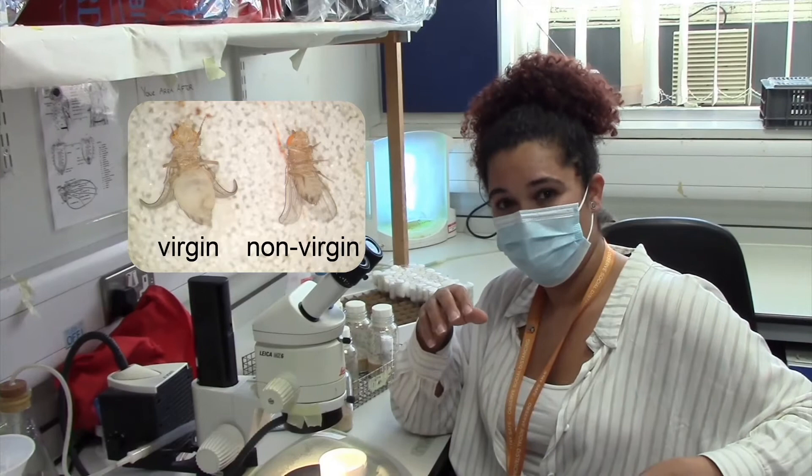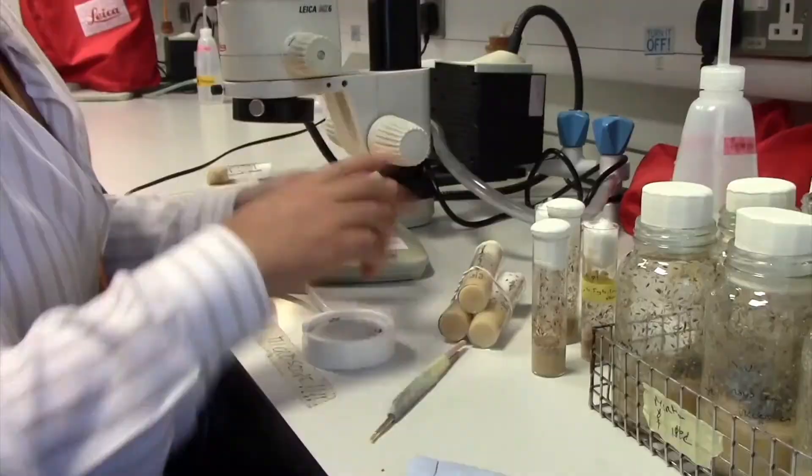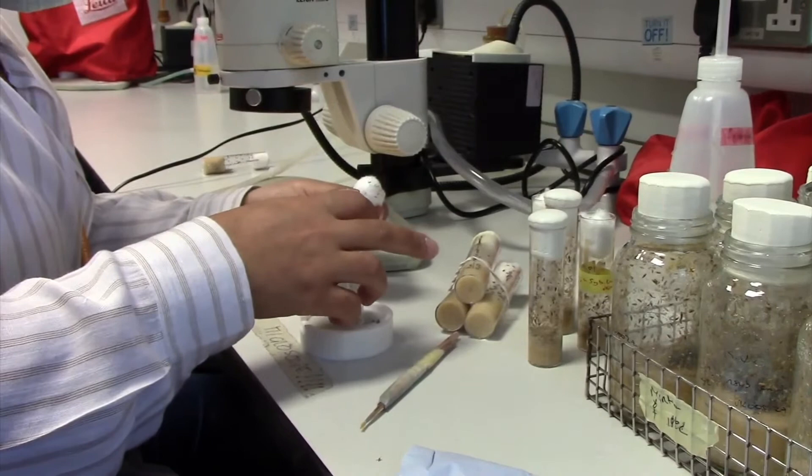that is the meconium, which is basically the last meal they have before they go into the pupae. When we have to cross a female with a male, we need to know that that female didn't mate with any other male before, so we need virgins to cross with a specific male of a specific genotype that we want.